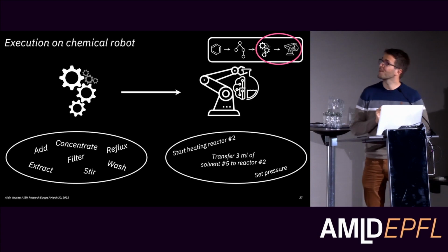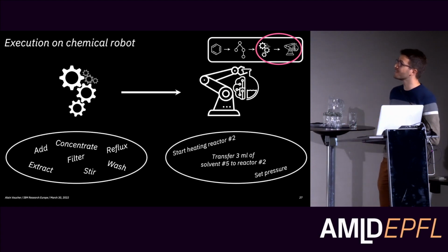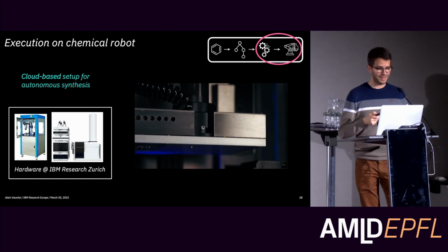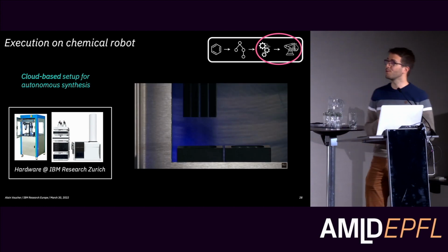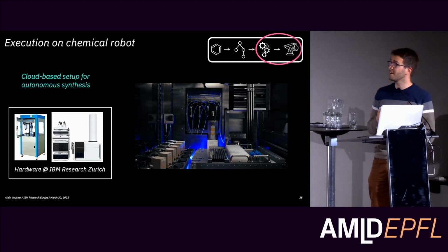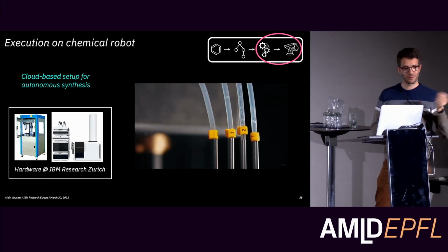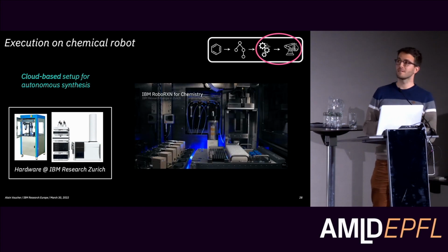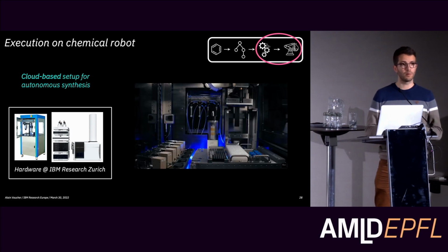I see that I have 1 minute left, so I will be fast. Basically, we then integrated it with a robot and a cloud-based platform where the user can start from the compound that they design, then do everything assisted with AI, the retrosynthesis, the determination of the actions, and then launching it on the robot, even remotely.